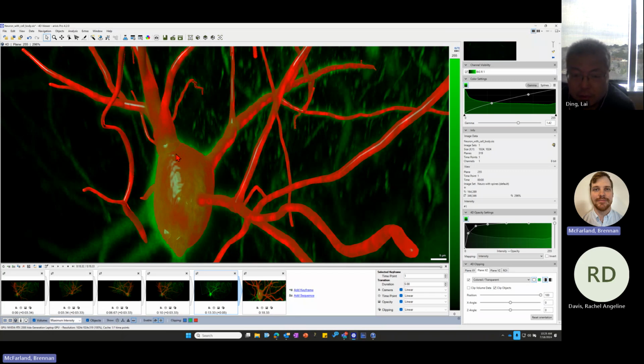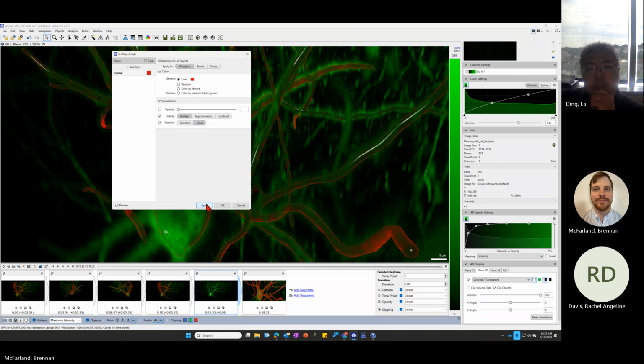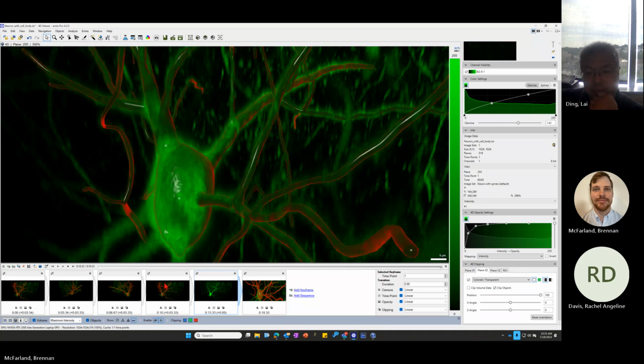We can then say, get rid of just this part within here, or show me this object here, kind of transparent and glassy looking, so I can see what's on the inside of it. And we can do either, clip away this object data, or clip away the volume, and then just show the underlying proteins if there are any in here.